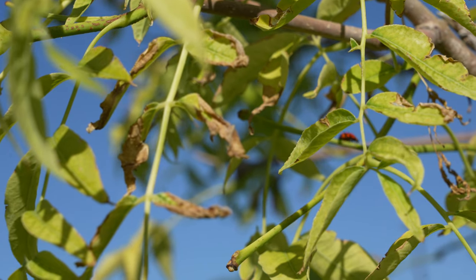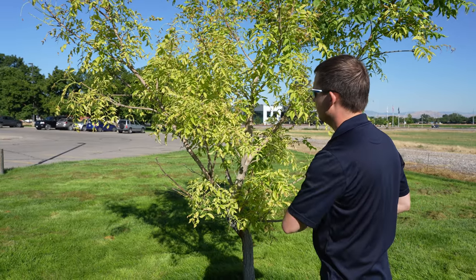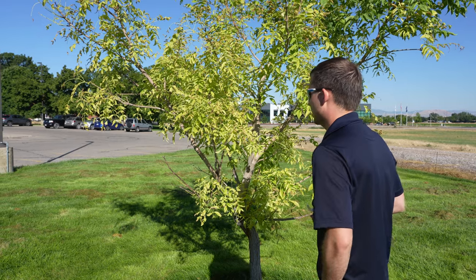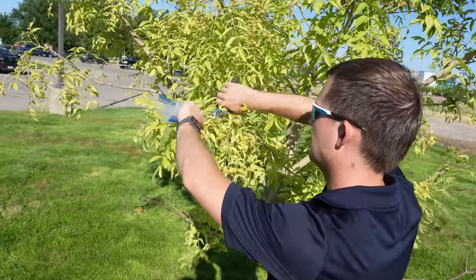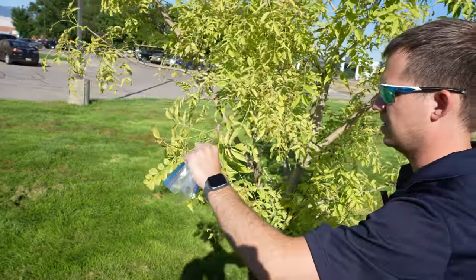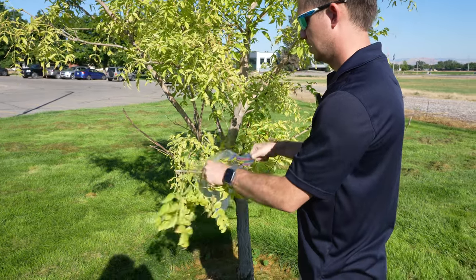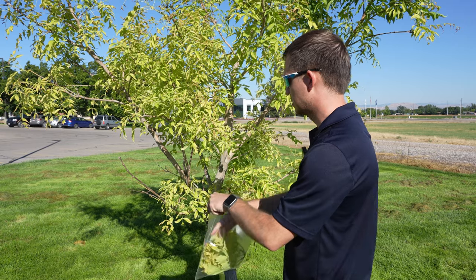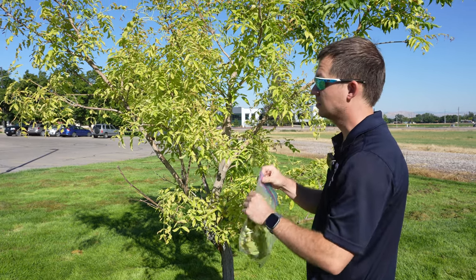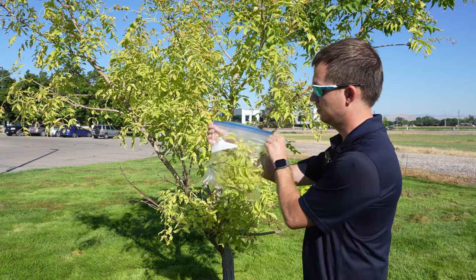Then we can collect the sample. In this case, I'm just going to prune off the tips of a branch or two and place them right in a Ziploc bag so it can be shipped to the diagnostic lab. If there are any other exposed areas of the tree such as roots, or if it is a fruit tree, the fruits, you can also collect those different types of tissues for submission.